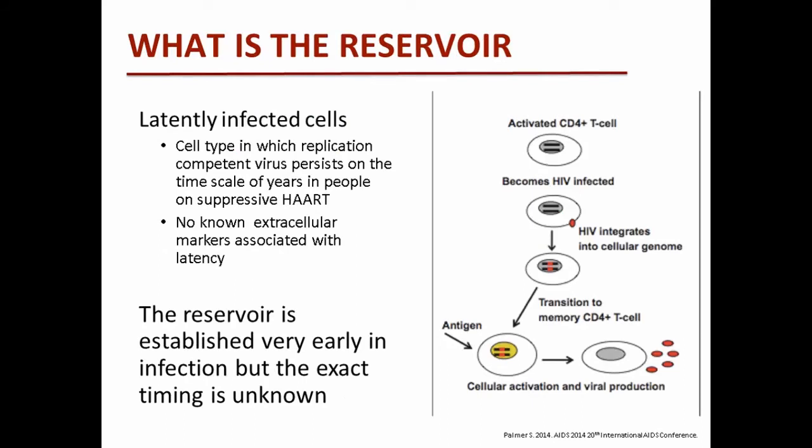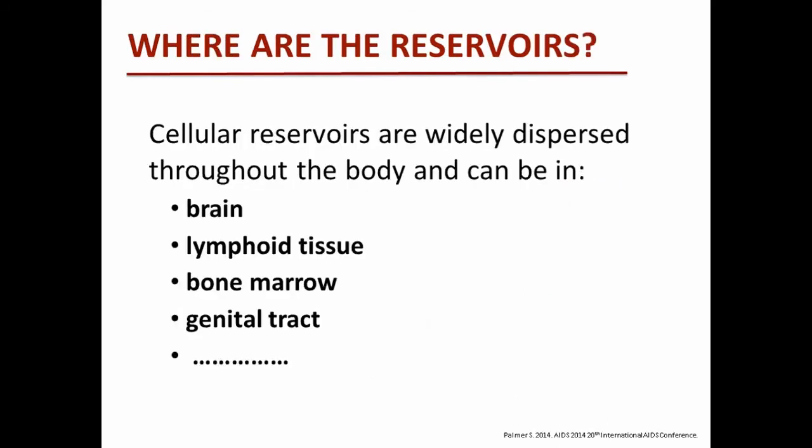How can you measure the reservoir? There are many, many systems to measure the presence of infected cells that do not produce virus, and to do this, what you have to perform are some assays activating cells and seeing how activated cells produce a virus.